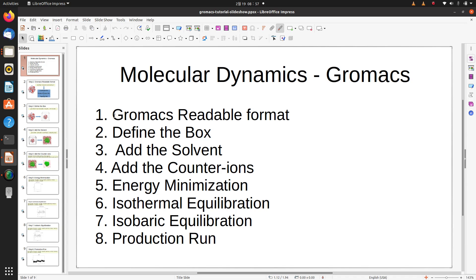In the next step we will define the box around the PDB, and in the third step we will add the solvent. Then we will add the counter ions to neutralize the system. After that we will energy minimize the system, perform isothermal equilibration, then isobaric equilibration, and finally run the production MD.